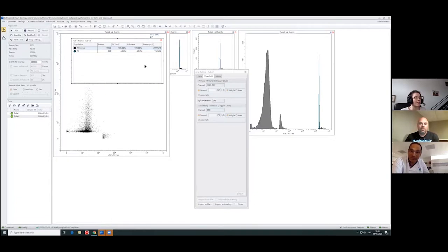So we're going to have to have something that can house large data files to be able to analyze this further. My computer is good enough. Just you have to be a little bit patient, but it's good enough. Even my laptop, I can analyze these files with no problems. It's not too bad. They don't get huge.